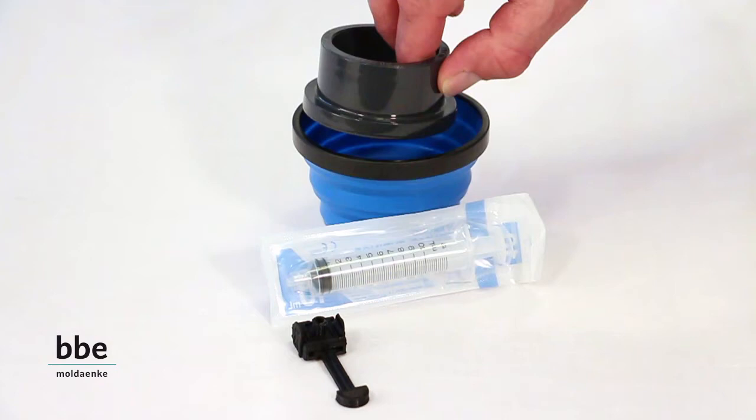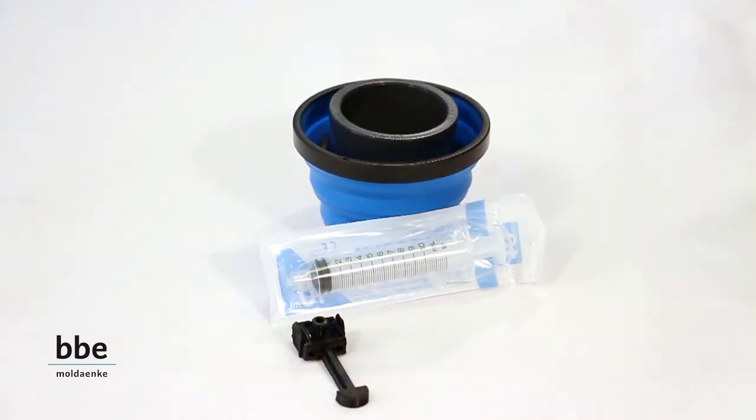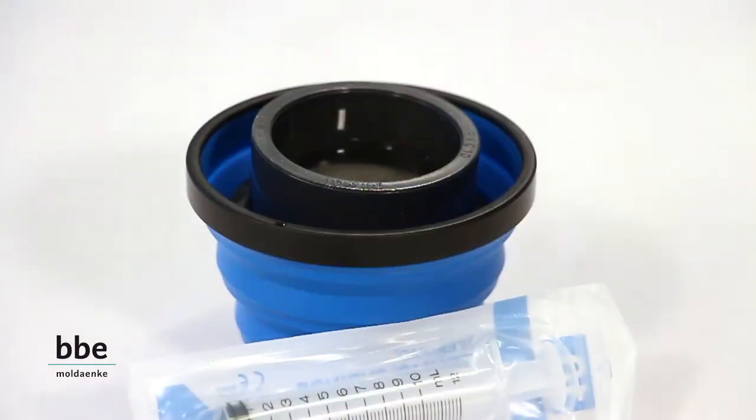To start with, take the ballast water sample and pre-filter the water sample into a cup. Use a 50 micron filter in accordance with the IMO-D2 norm.